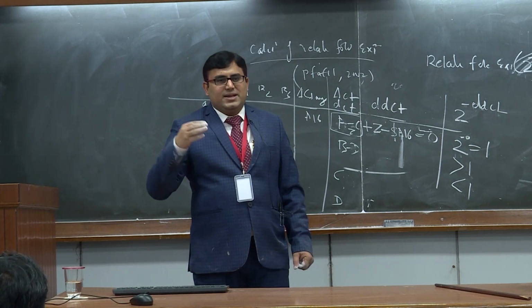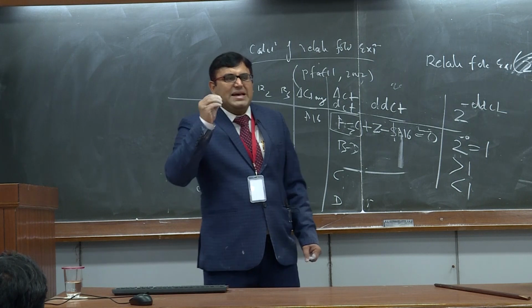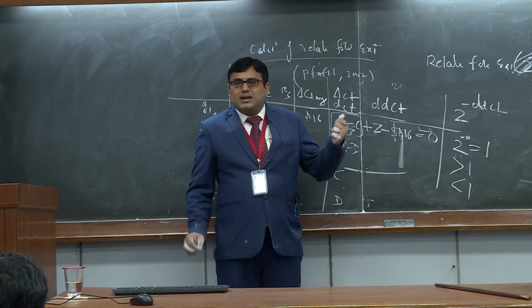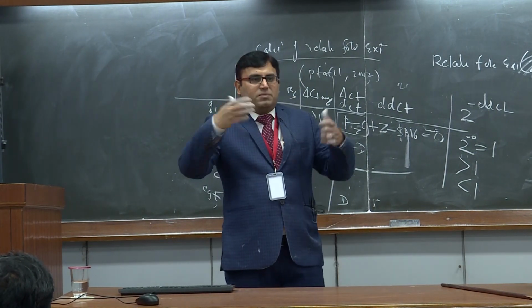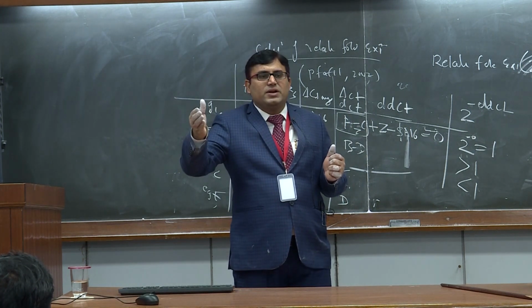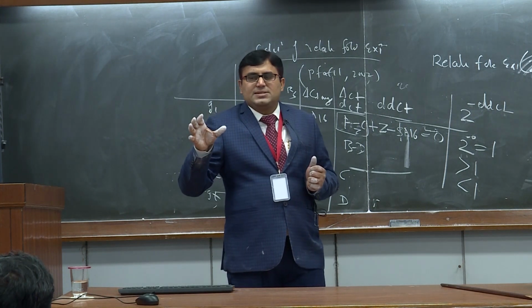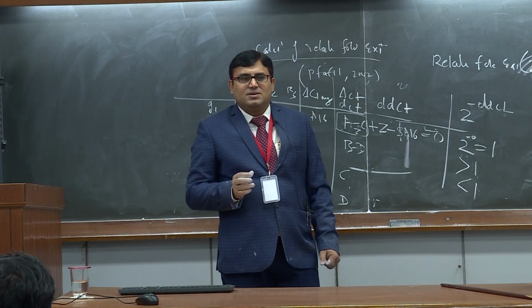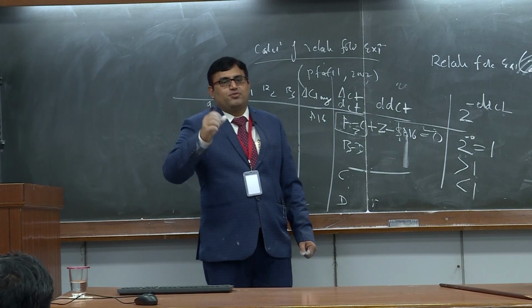When writing about expression, the best sentence is like: the expression of gene X was upregulated, and whatever number of times, you can write in brackets, maybe 3 times upregulated as compared to control. This is the sentence people prefer to write in manuscripts. In one sentence you can explain the fate of the expression of your gene.